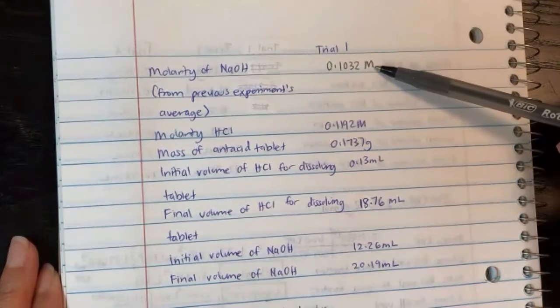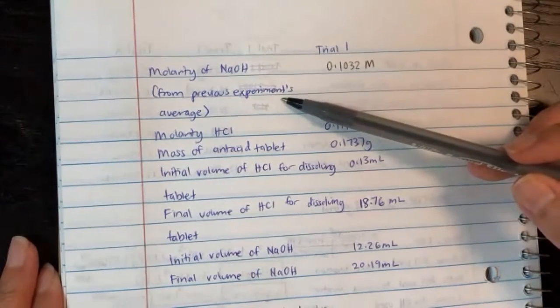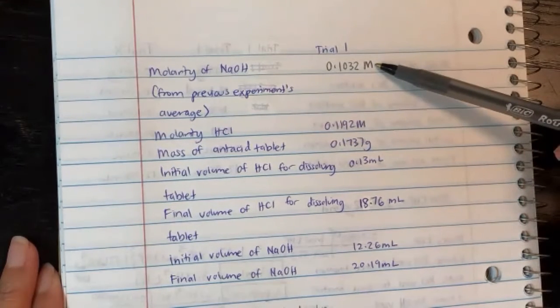This number will not be the same as your average, so you'll have to use the previous experiment's average, which is trial 1 plus trial 2 plus trial 3 divided by 3. And then let's say you come up with an average of 0.1032 molarity, that will go over here. So make sure you copy this number over from your previous lab's data.